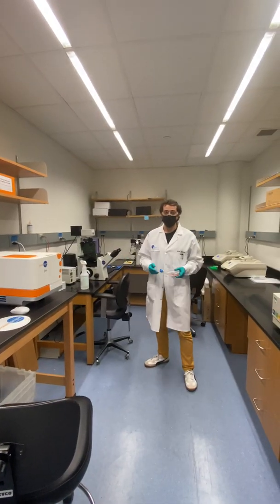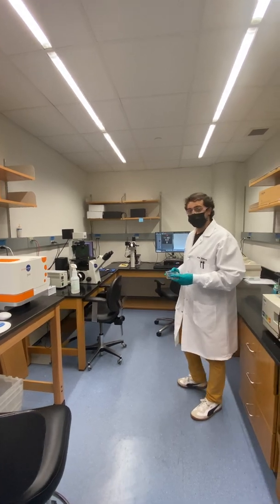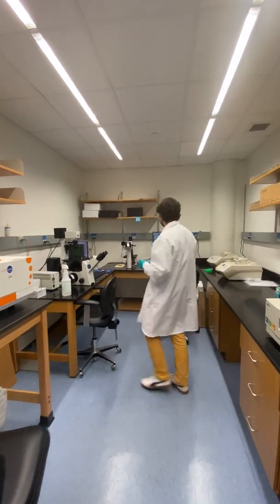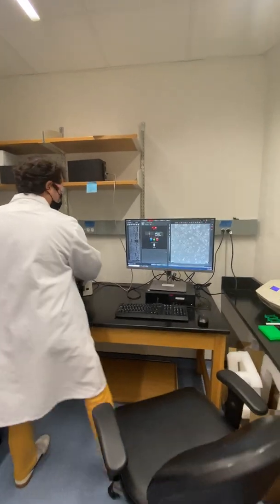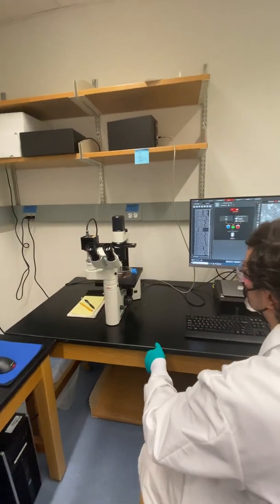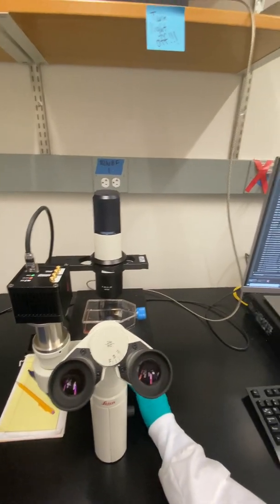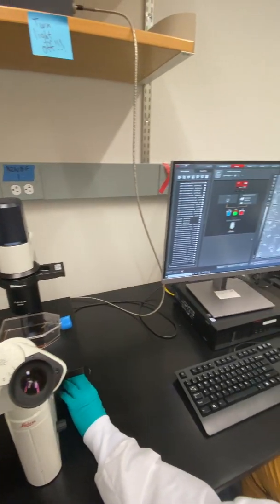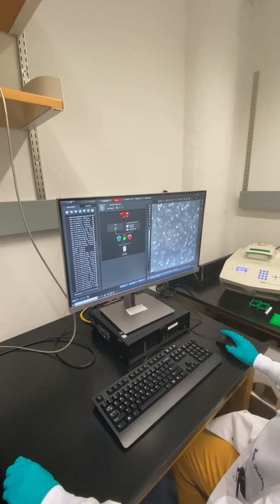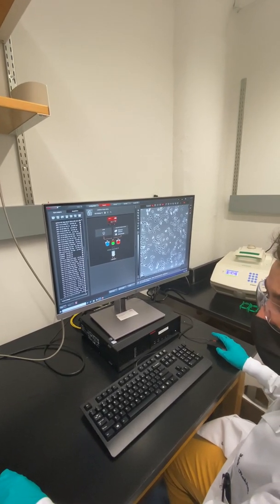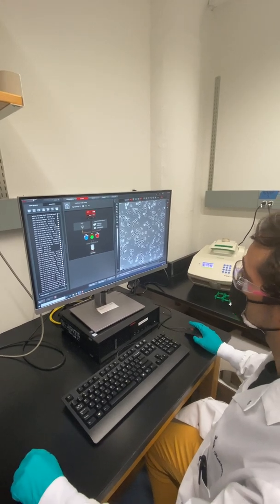Welcome to our microscopy room. This is where we take a look at the cells and visualize them. These are one of our microscopes, and these are the Vero cells that we work with. Once we focus, you can see some of the cells up close. This is how we determine how many cells we have in our flask and if they look healthy or not.